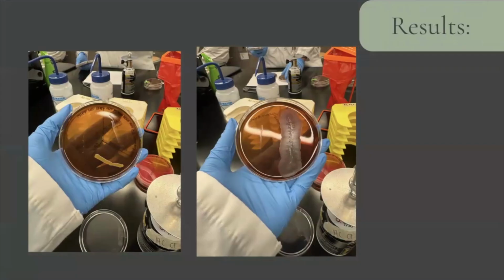For the CNA agar and E. coli, we saw no growth, because the colistin and nalidixic acid inhibit the growth. In the S. aureus, we see nice growth, so it's gram positive. And for the S. pyogenes, we don't see growth, but we should have, so that could have been due to human error. In the unknowns, we see lots of growth in 114 on this side, and it's most likely gram positive. And for unknown 294, we see no growth, so it's either gram negative or it could have been human error.